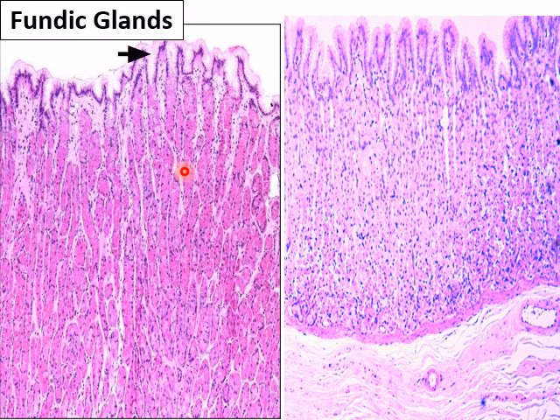Again, dear students, this is the pit, characterized by being narrow and shallow. And these are the fundic glands, which are crowded. Less connective tissue, corium, can be seen between the cells. Again, dear students, this is the fundic gland.